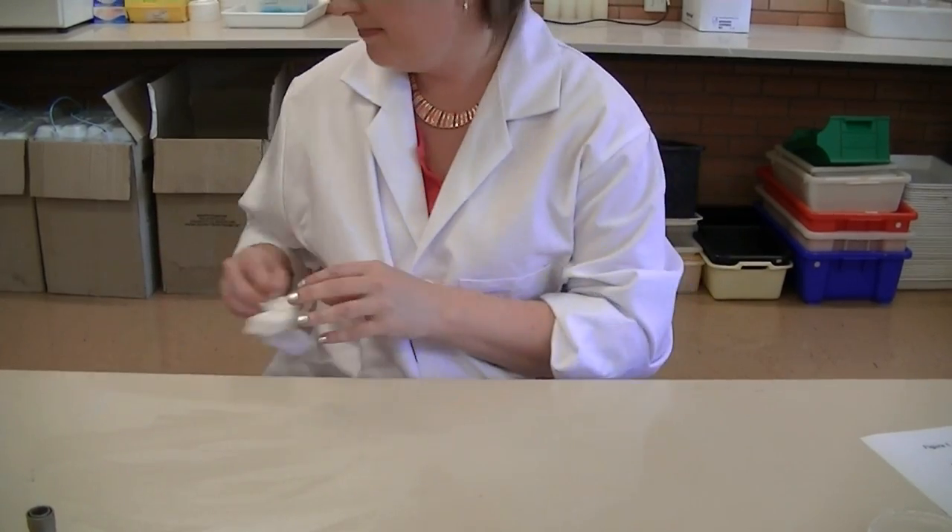Wipe down the disinfectant with the tissue and pop that in the bin. You must also make sure that you wash your hands before you leave the lab. Now you have the knowledge and have seen how to perform a streak plate technique — go forth and streak plates!